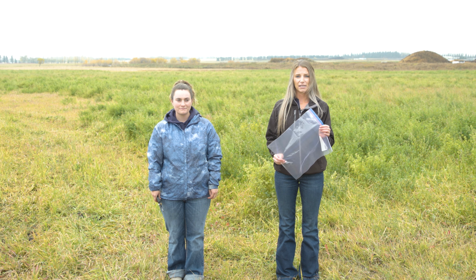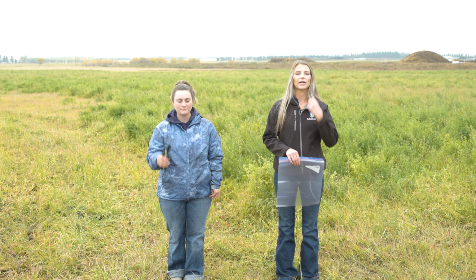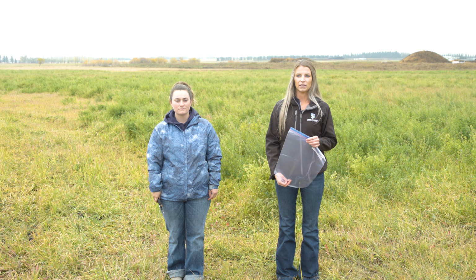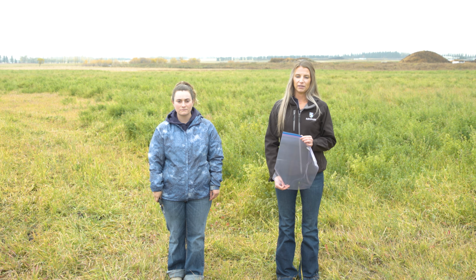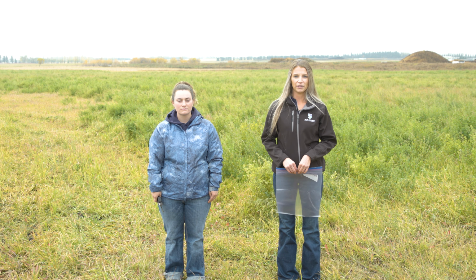The sample collection portion is very simple. All you need is a large bag to collect your samples in and a sharp pair of snippers to cut the plant themselves. When you're cutting the plant, you want to get both the stems, leaves, and petioles, so you get a representative sample from the entire plant. When you're taking your samples, you want to take them from a number of areas throughout the field. You'll do a zigzag pattern across the field and collect samples at each point.